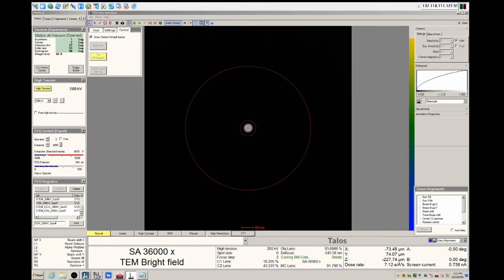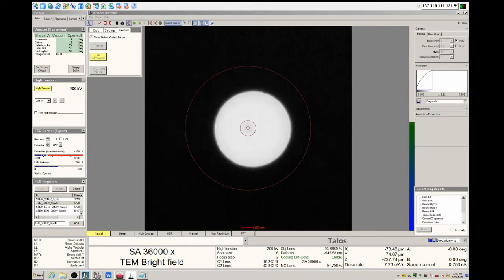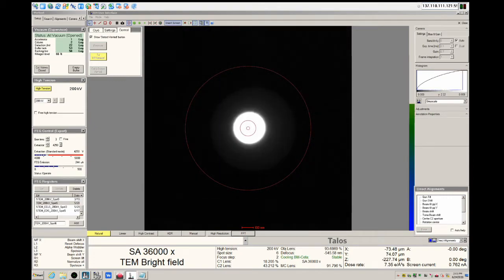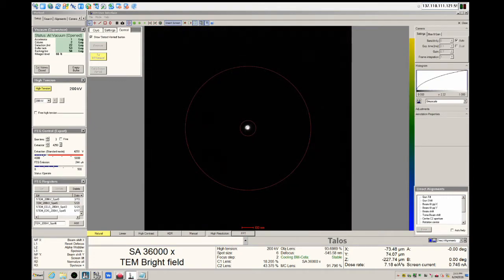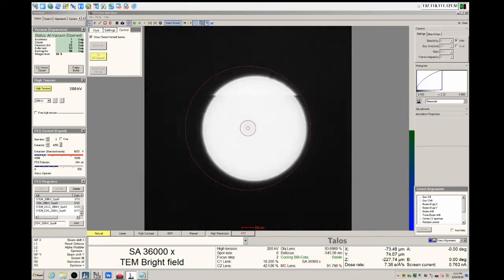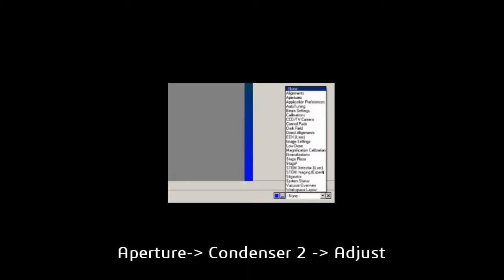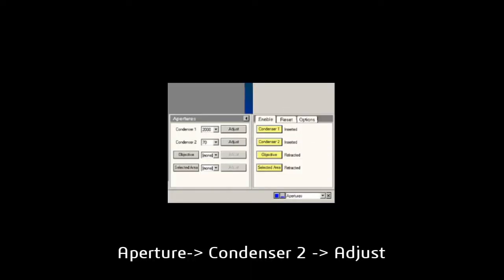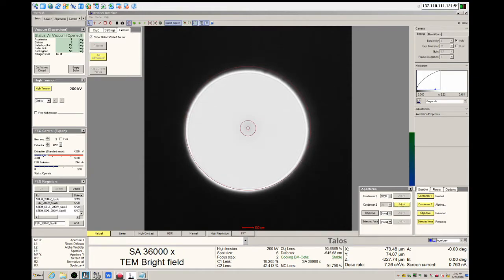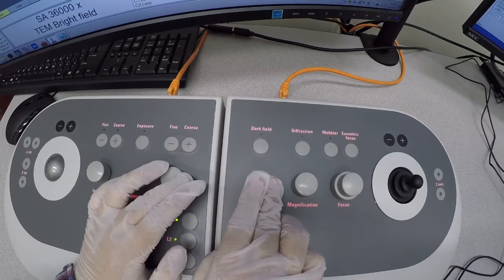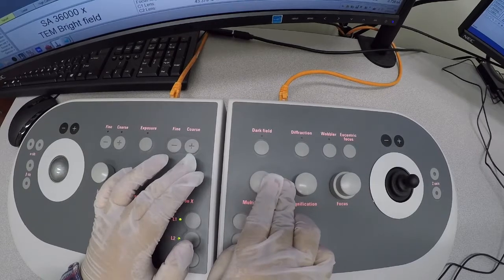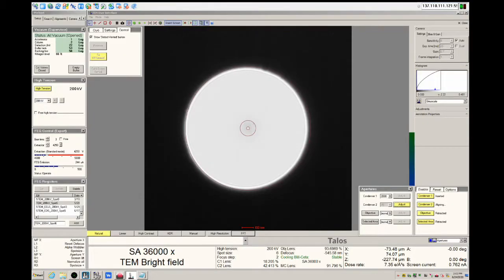The next alignment requires a larger spot, so increase the size of the spot with the intensity dial to be almost the size of the outer circle. Select apertures from the bottom right. We will be adjusting the alignment of the C2 condenser lens aperture. Never adjust the C1 aperture. The goal is to align the spot on the screen with the outer circle using the multifunction X and multifunction Y dials as before.